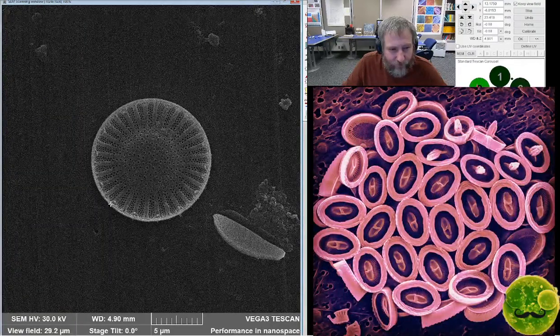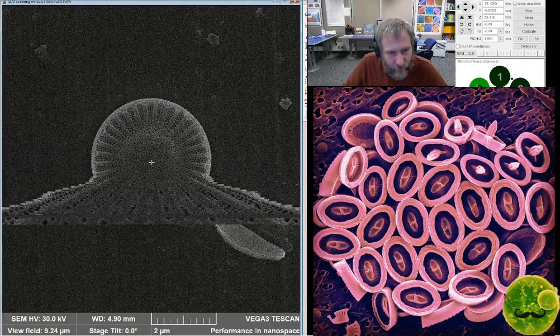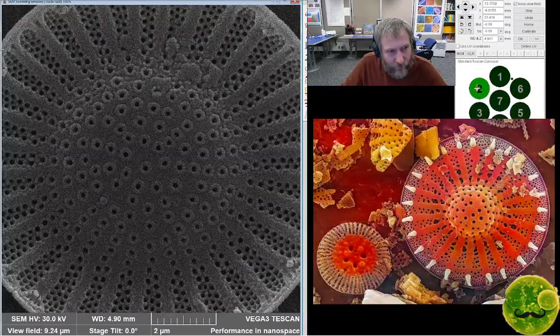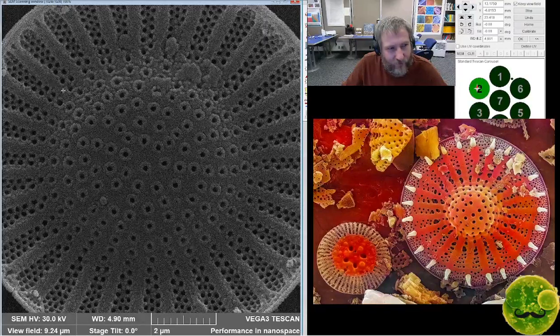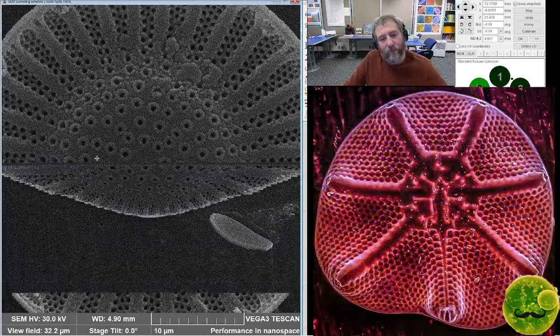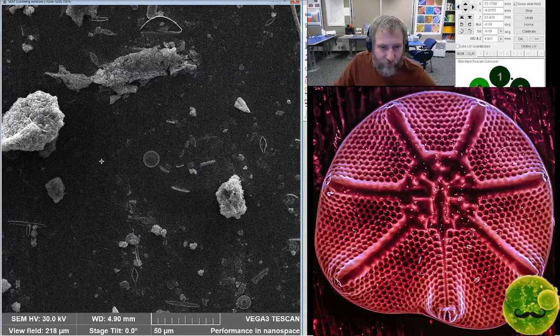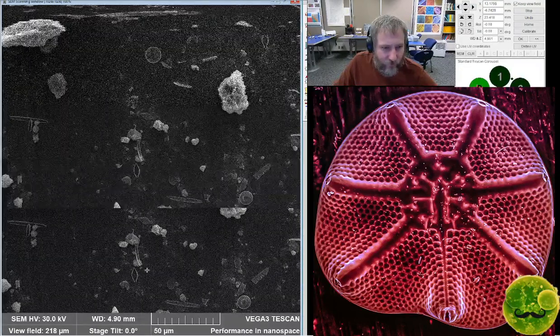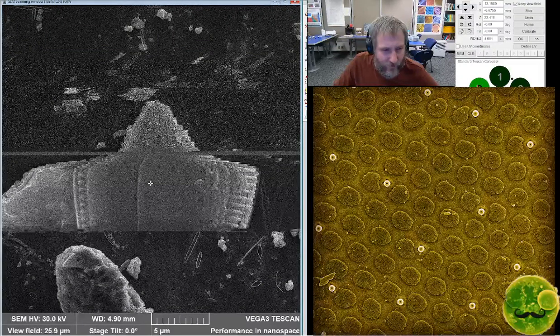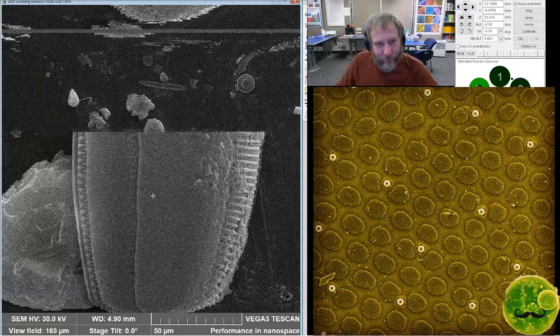This actually looks like a... It's not a stephanodiscus. It's a cyclostephanos. The structure goes all the way to the edge. The costi structure goes all the way to the edge, and it bifurcates right before the end of the valve in perfect Cyclostephanos fashion. It's too bad, it's a little too dissolved for me to get too invested in. It's a weird view of Europalodia, epithemia, I think.